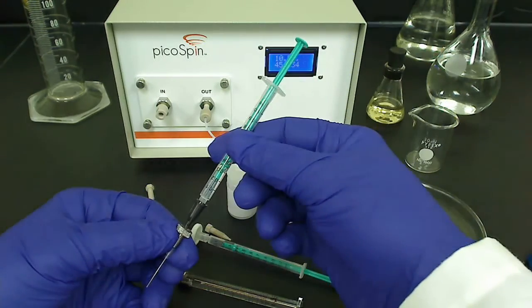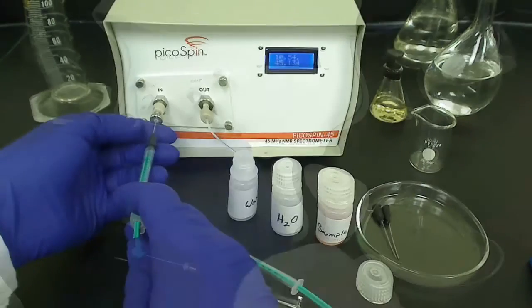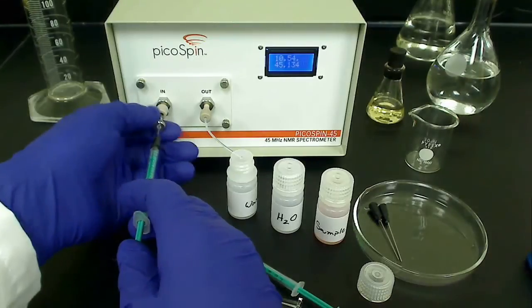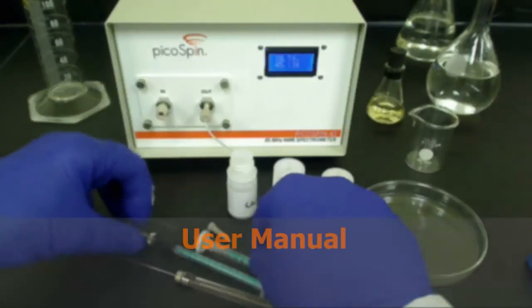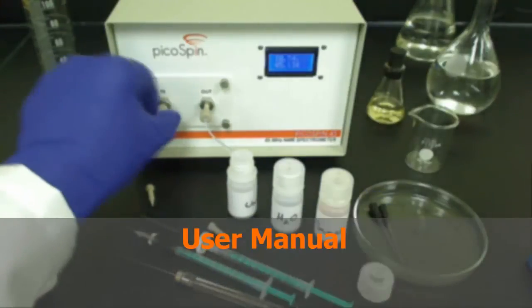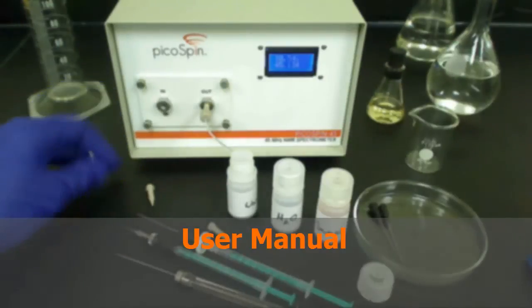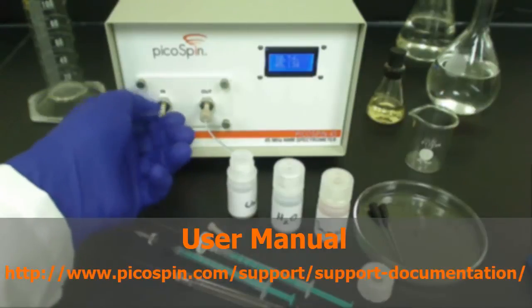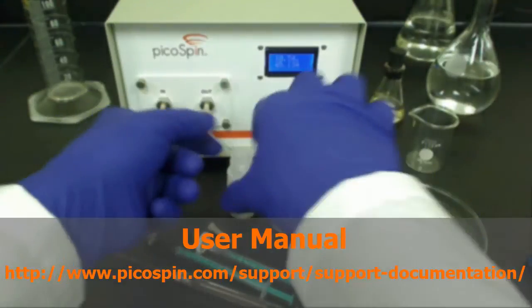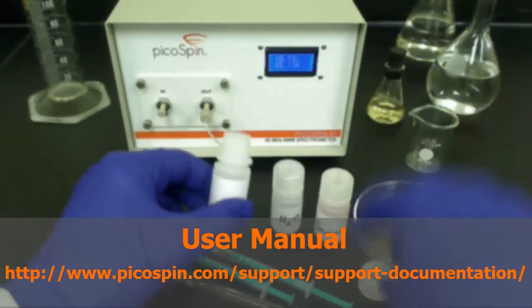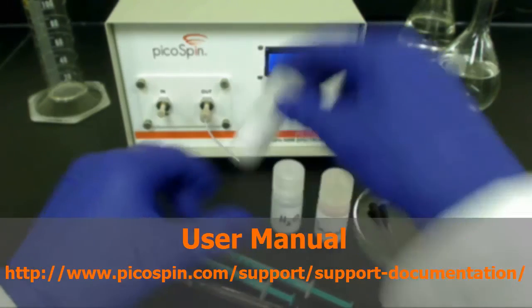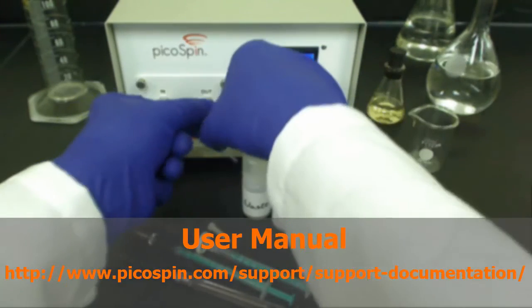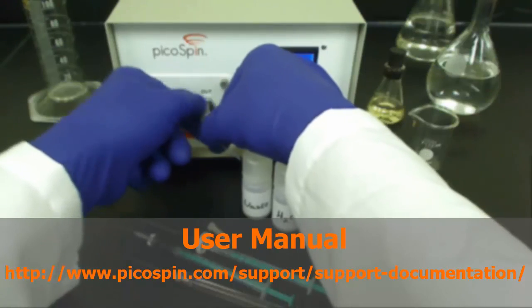In this video, we explored the procedure for sample injection using classroom and laboratory kit accessories. Remember, there is a written description of the information contained in this video in the System Operations section of the PicoSpin 45 User Manual under the heading titled Sample Handling, and in the documentation accompanying the classroom and laboratory accessory kits. These documents are located under the documentation section of the support page of our website at www.picospin.com. Both HTML and PDF versions of the documentation are available.